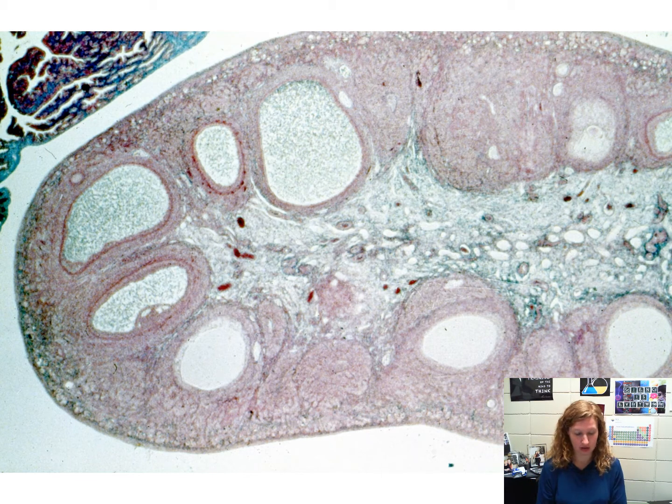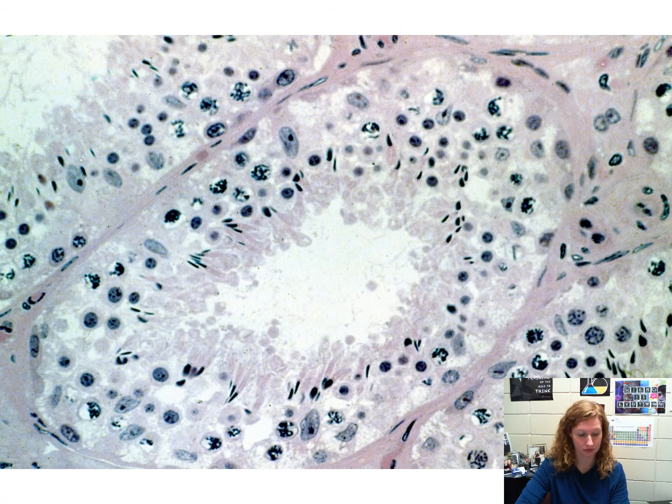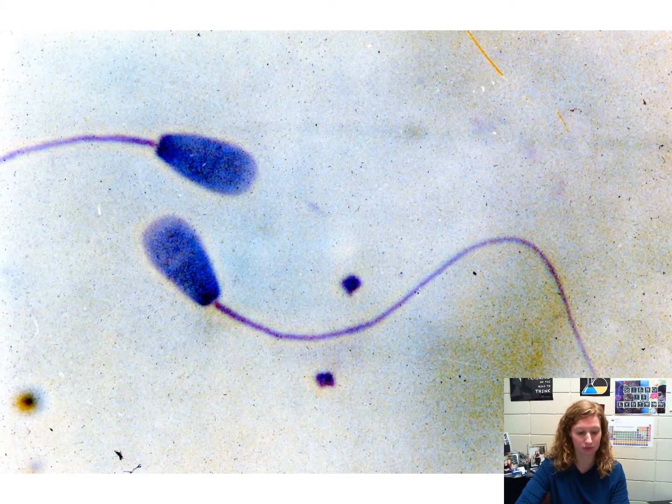This is ovarian tissue with follicles. This is an ovarian follicle. Tissue in the testes. Sperm.